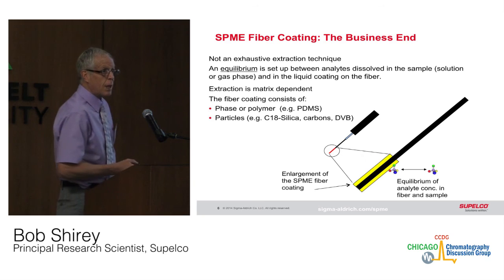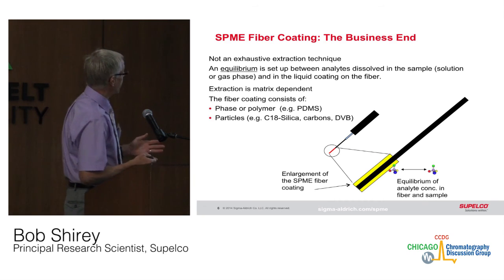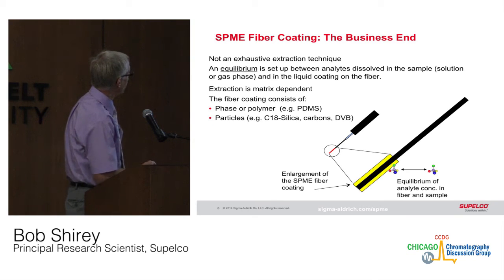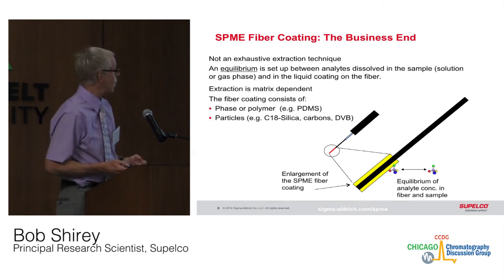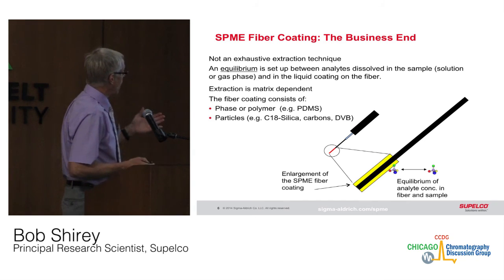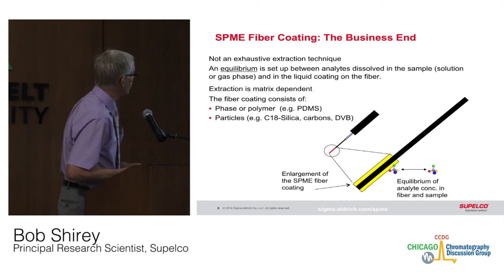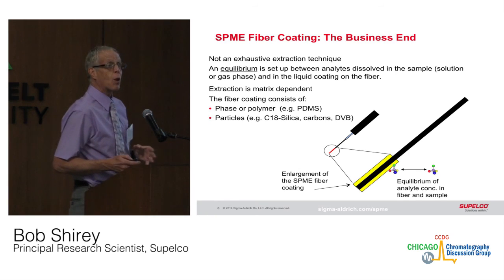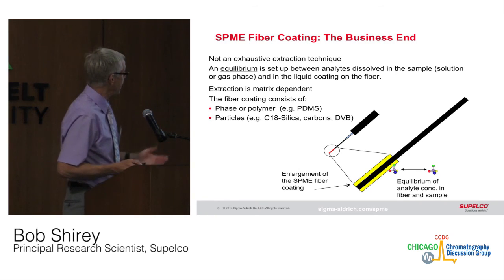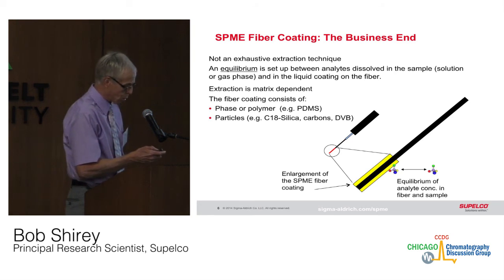The thing about SPME is that it is a non-exhaustive extraction technique. It's an equilibrium method, and it is very matrix dependent and dependent upon the coating on the fiber. The fiber coatings usually consist of phases or polymers, and these polymers may also contain particles such as silica, carbon, or porous polymers.